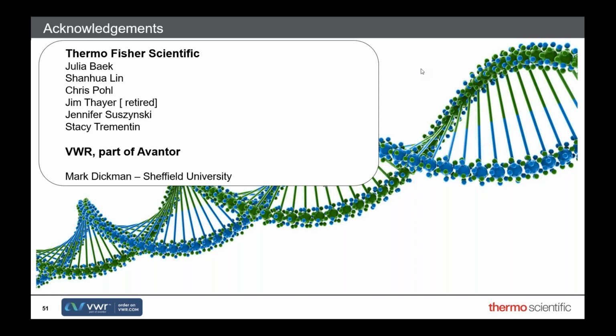Still lots of questions coming in. So how do you quantify impurities on MS without reference standards? Again, it's all going to be relative. So you're going to be looking at relative quantitation unless you have the reference standards. So there's nothing you can do about that.